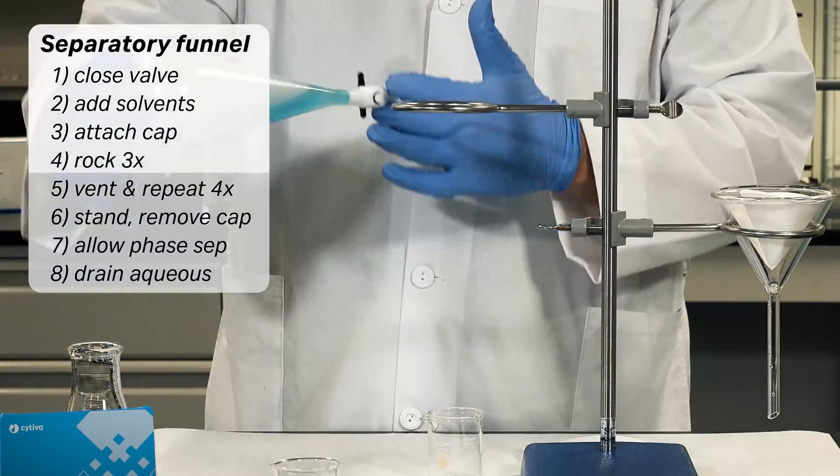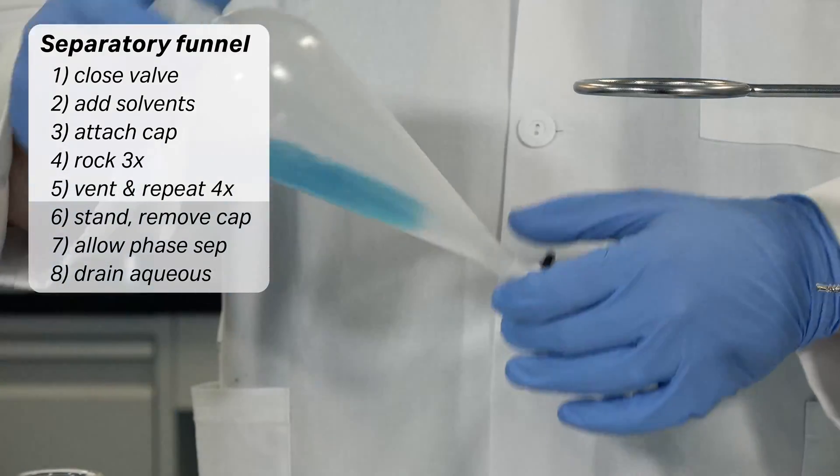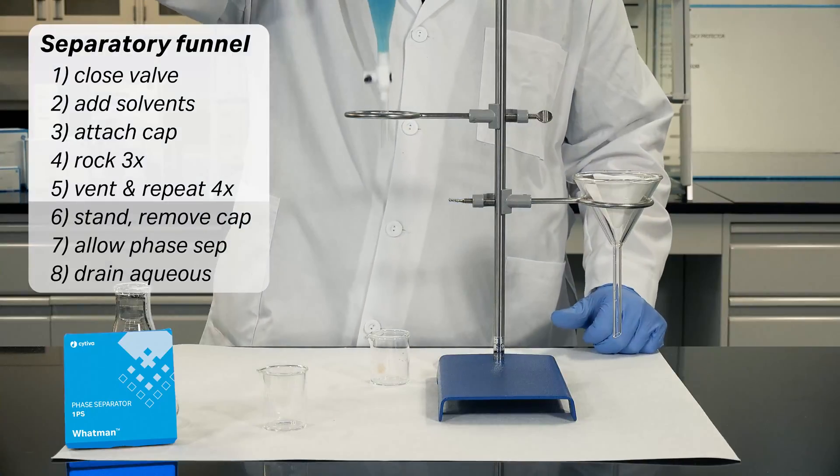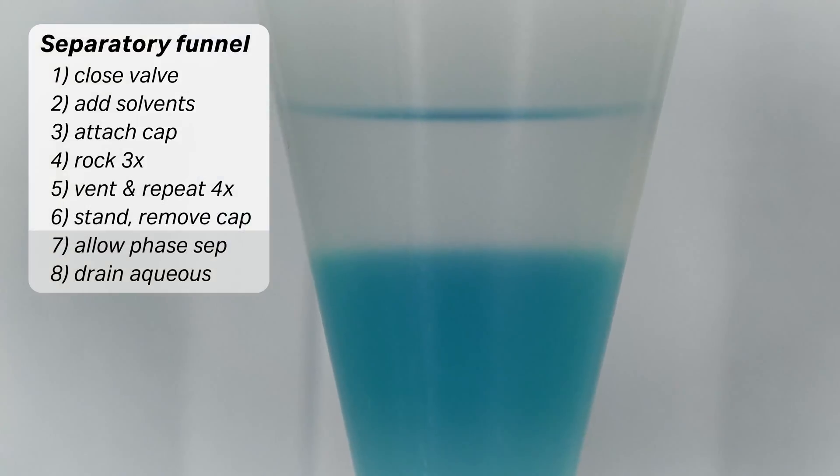Rock the separatory funnel back and forth three times. Vent the separatory funnel to prevent the buildup of pressure. Repeat this process four times. Place the separatory funnel in the ring stand and remove the screw cap.